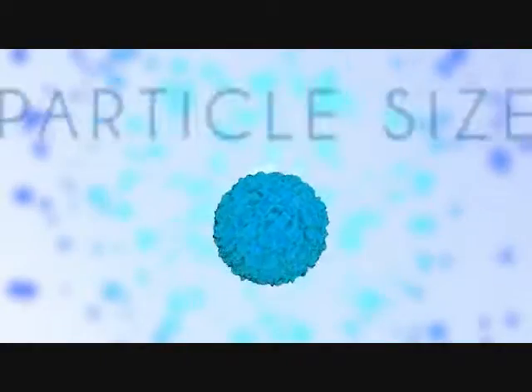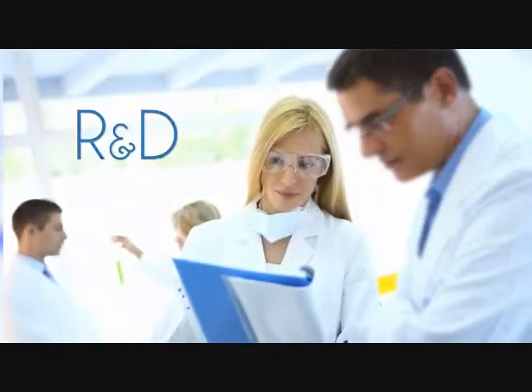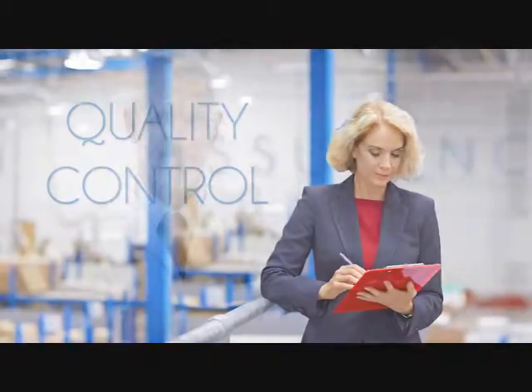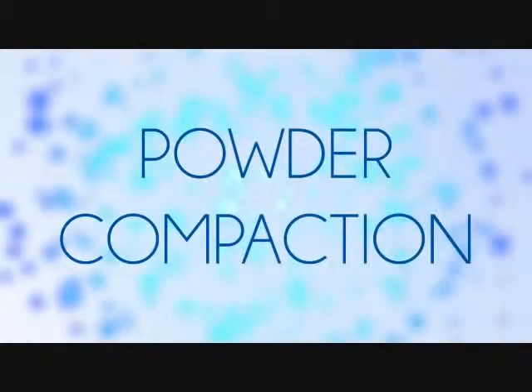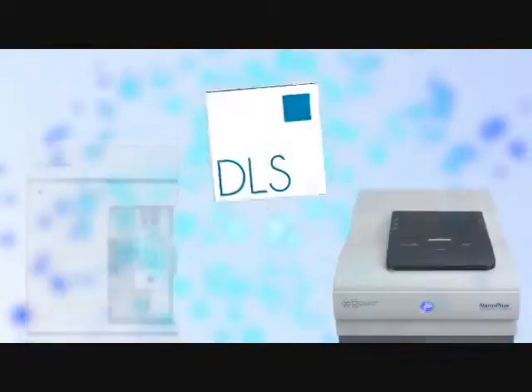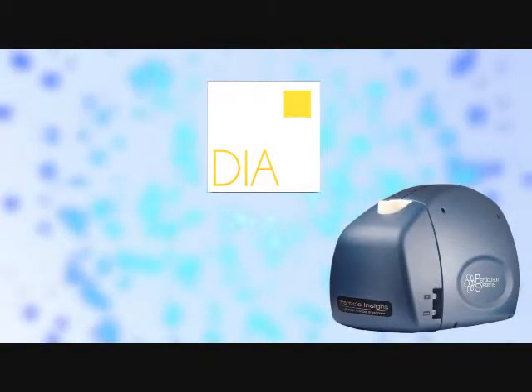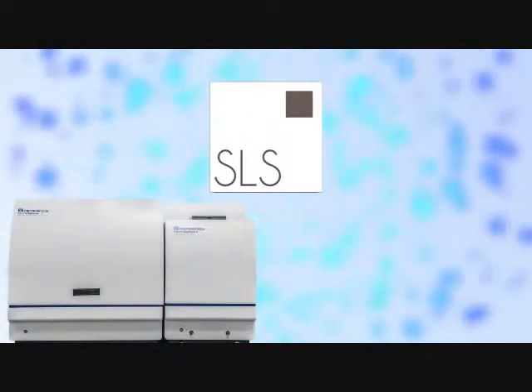Understanding the physical characteristics and particle size is important for various elements of research and development, quality control, and assurance, as well as production in the powder compaction or blending process of potential products. In order to determine which techniques and instruments are right for you, it is important to understand what these techniques are actually measuring and how that influences the determined particle size.